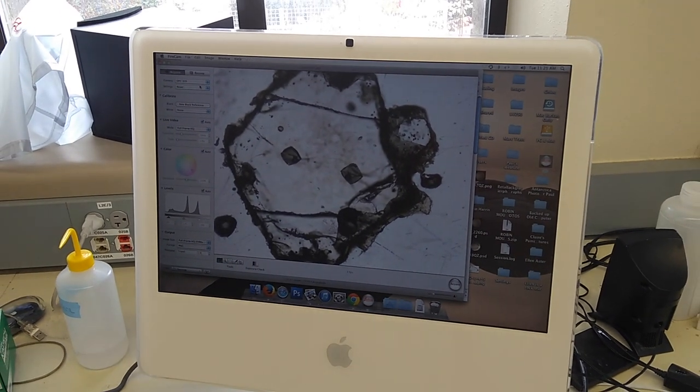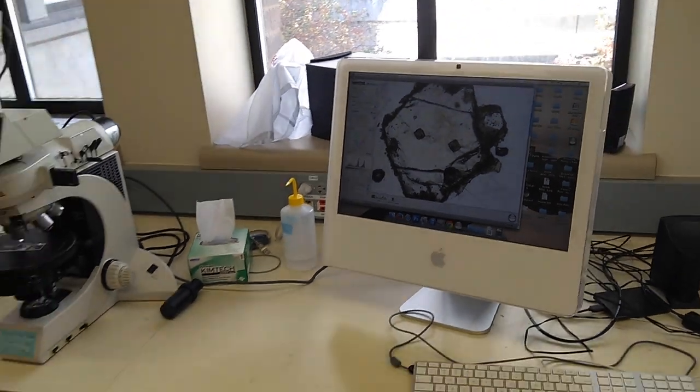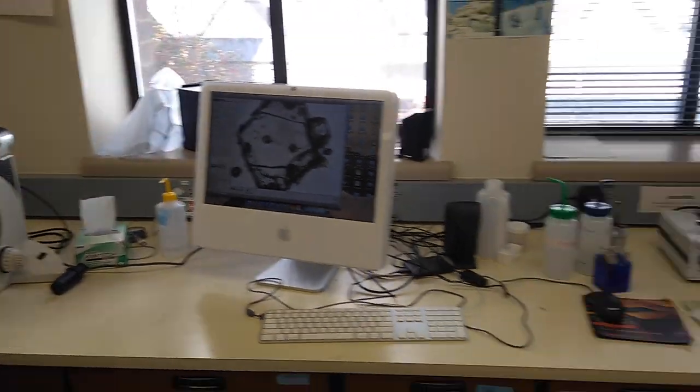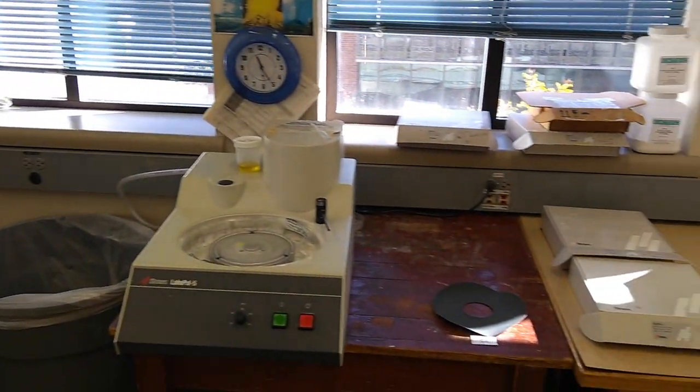Now that this side looks good, we will flip over the sample and polish again on the other side.